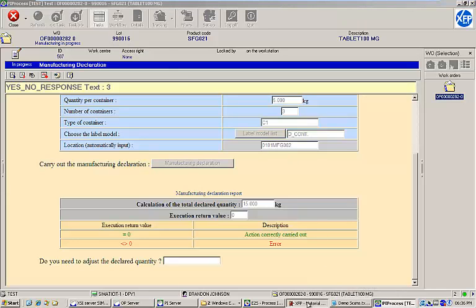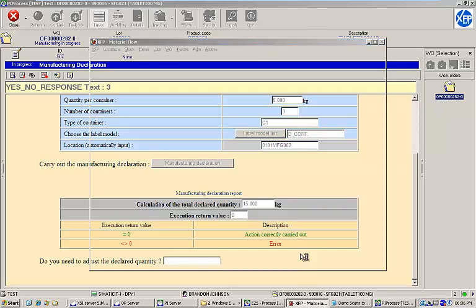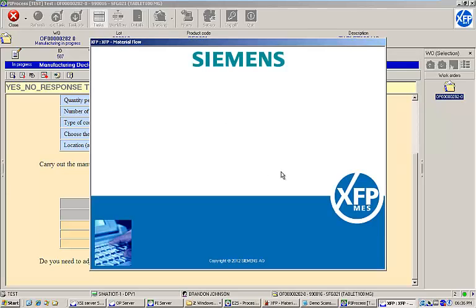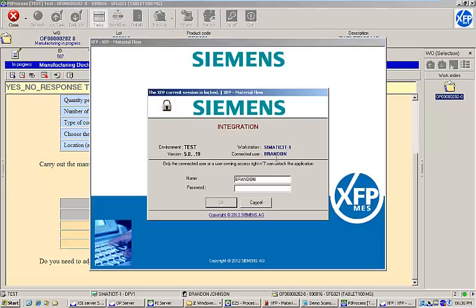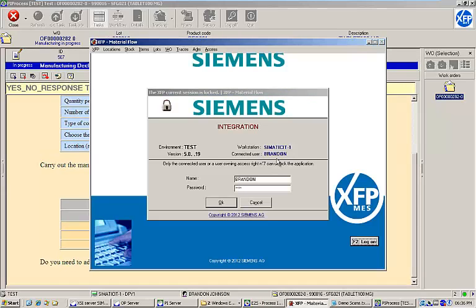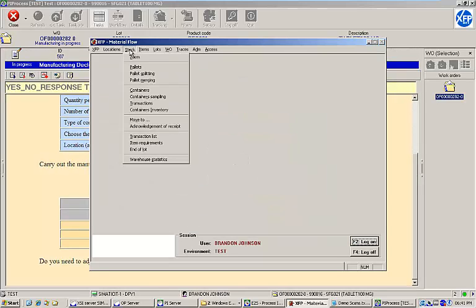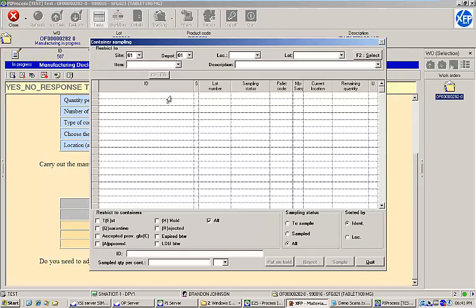If we take a look at our container inventory for the manufactured lot, we can see that three containers at five kilograms a piece have been automatically created.